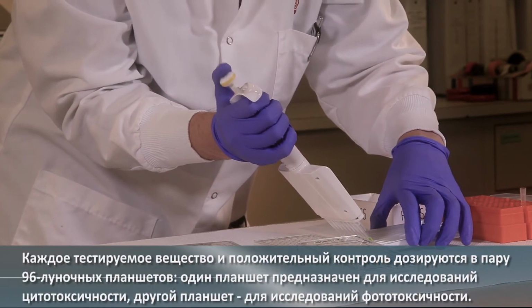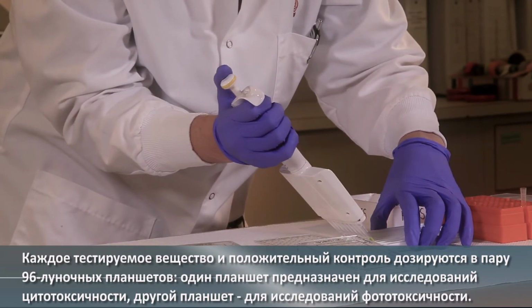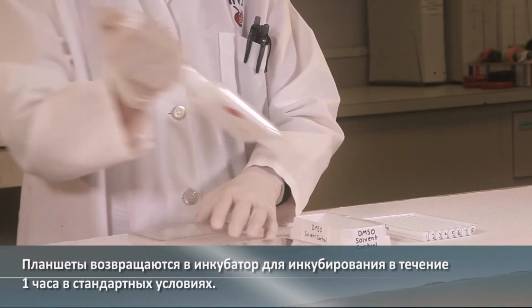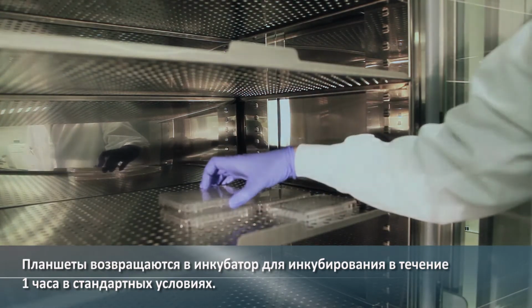Each test substance and the positive control are dosed onto a pair of 96 well plates, one plate for cytotoxicity and one plate for phototoxicity assessment. The plates are returned to the incubator for a 1-hour incubation period at standard culture conditions.